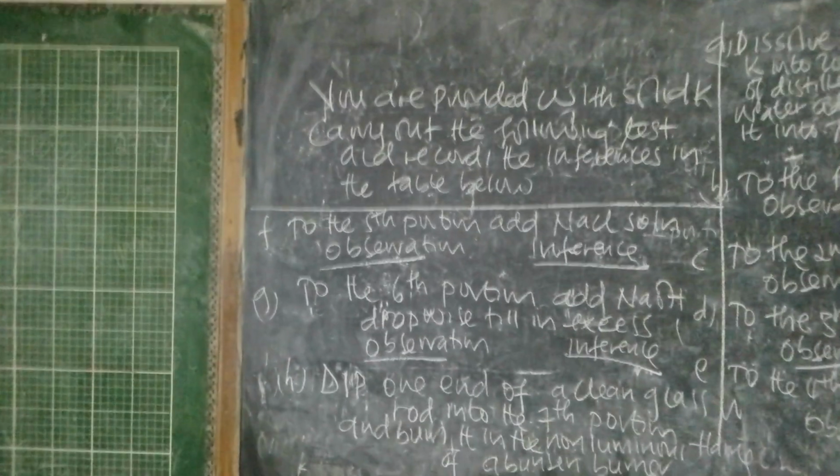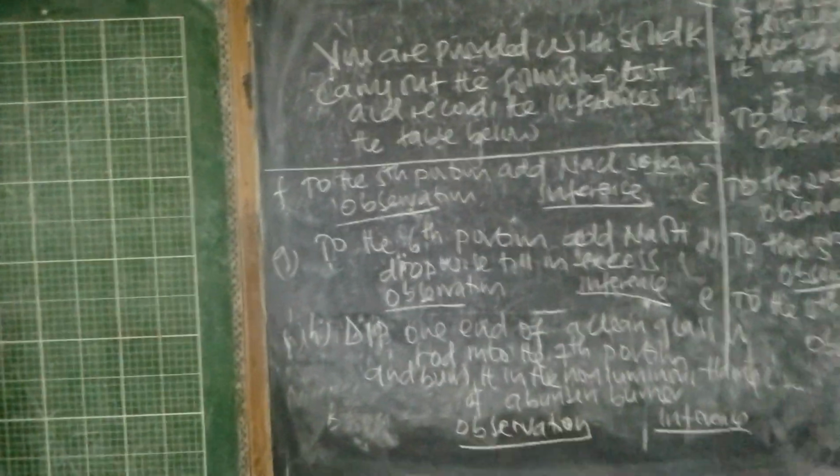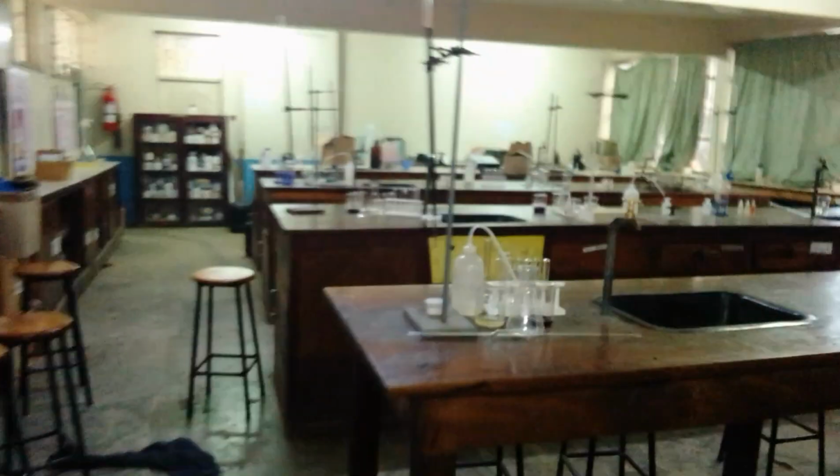And as you can see on the board, this is the procedure that they were using, and they were proceeding with it, but time was not allowing. So in the long run, they will be coming very early here in the morning to continue with their practicals. But so far so good. They have done the first volumetric analysis, and they'll be proceeding with the qualitative analysis tomorrow.